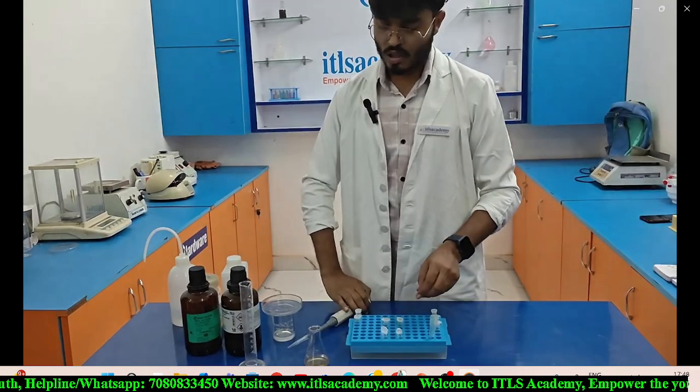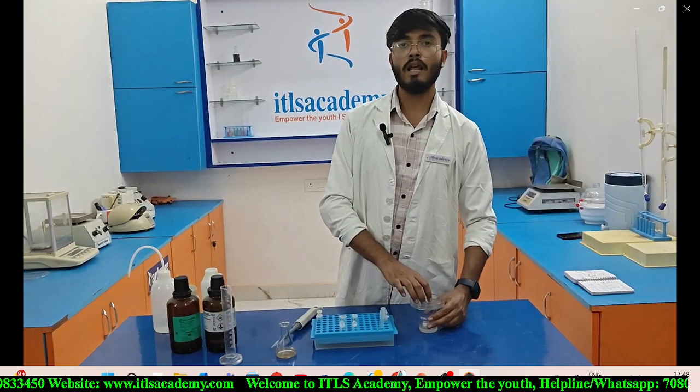So now after discarding the supernatant, I am going to add a solution of chloroform and isoamyl alcohol. The ratio of chloroform and isoamyl alcohol is 24:1. For preparing this solution, I add 12 ml of chloroform and 0.5 ml of isoamyl alcohol. So now after preparing this solution, we need to add 600 microliter in each of the Eppendorf tubes.